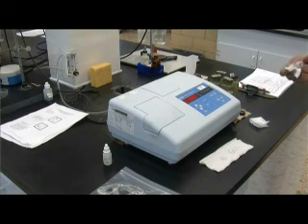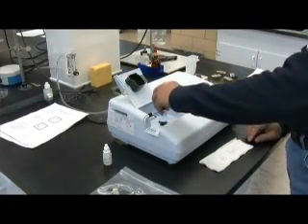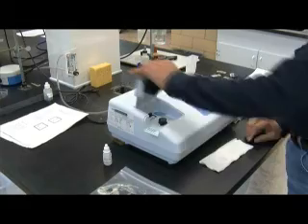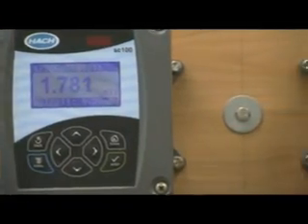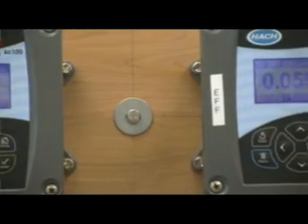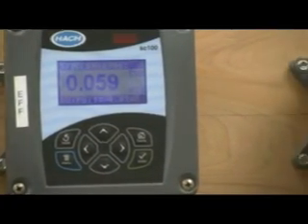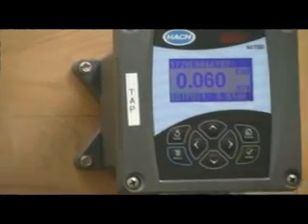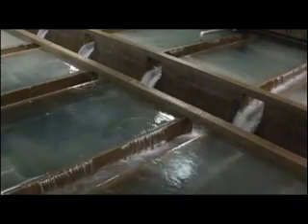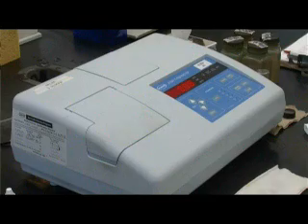Finally, the turbidity of the finished or potable water is checked to make sure that all large particles that could harbor potentially harmful pathogens have been removed. The turbidity standard for finished water is to have a turbidity of less than 0.3 NTU in 95% of your samples and no samples exceeding 1 NTU. The finished water leaving the Evanston treatment facility has an average turbidity of 0.08 NTU, well below the required standard.